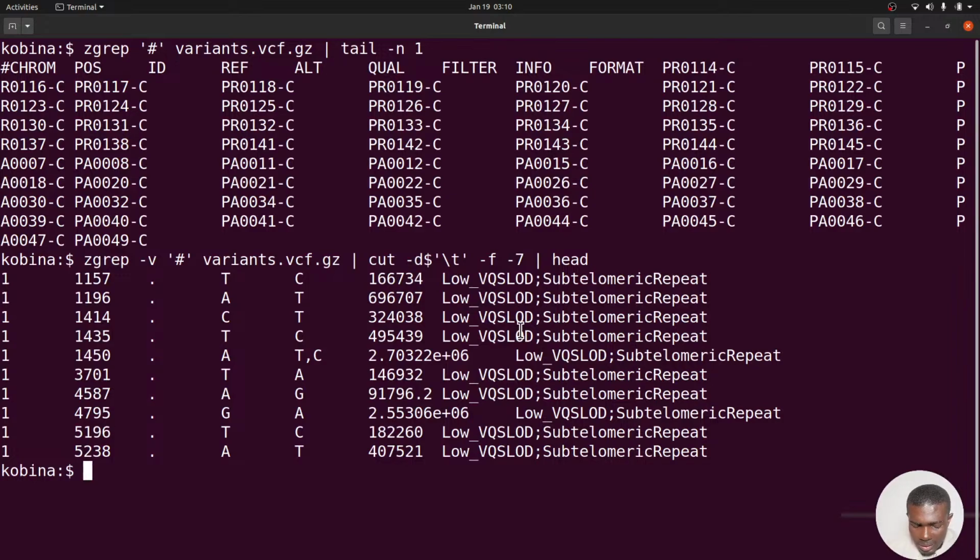So just by combining some of these Linux commands, it can make you do a lot of work. You can do lots of stuff here if you know these commands and you're able to combine them properly. So you can do things such as this one. So Linux is pretty straightforward. I mean, if you have the right materials, you can quickly learn and then use that to do a lot of stuff. So this one like this, let's just clear the screen.